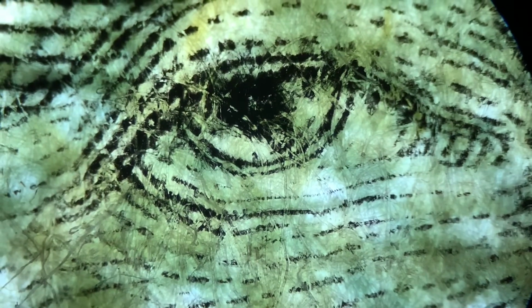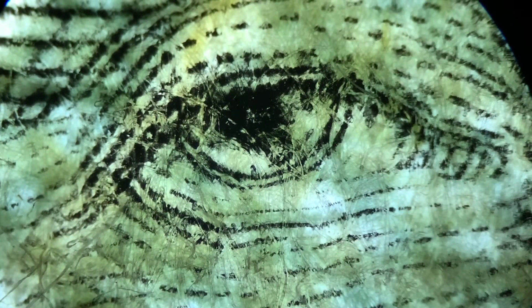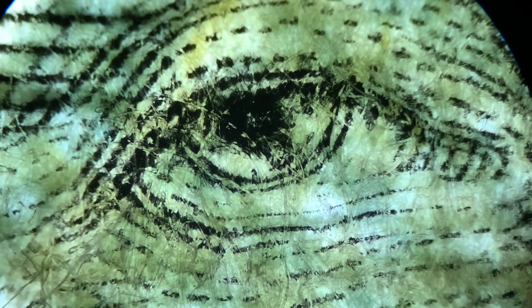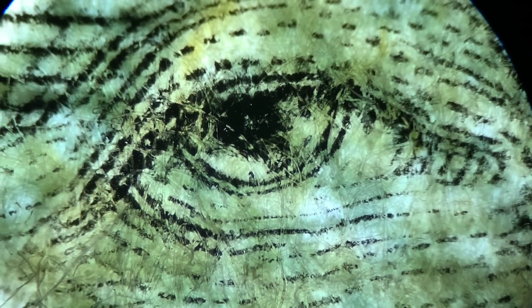Here's an up-close look at President Washington's eye. As you can see, we have a lot of different fibers here, and the bill is actually not paper. It's a cloth and cotton material with silk in there, and we can see the ink process right here stamped on there.